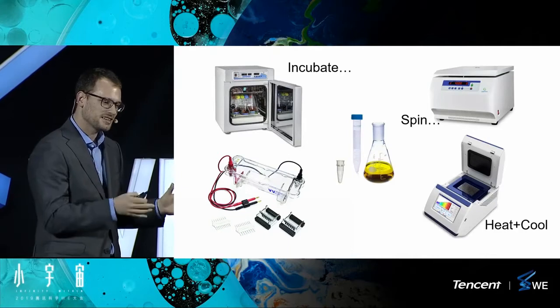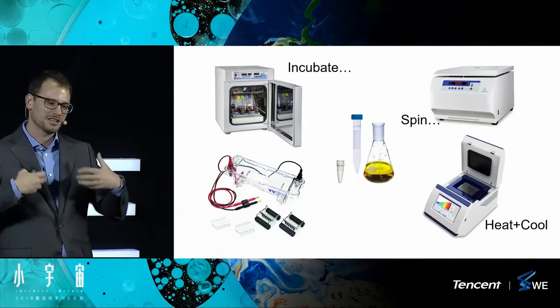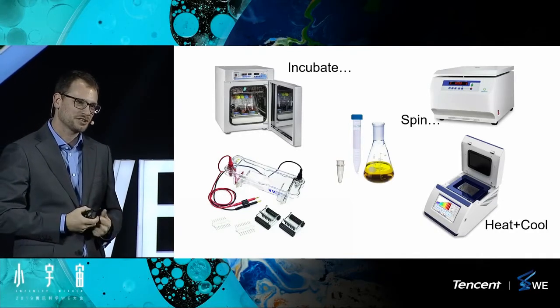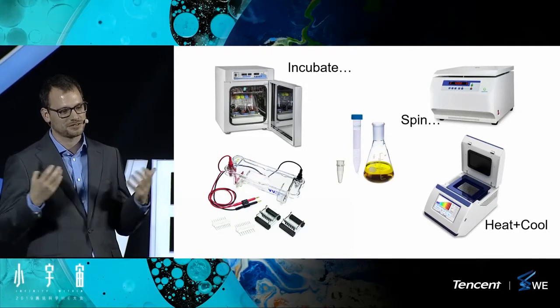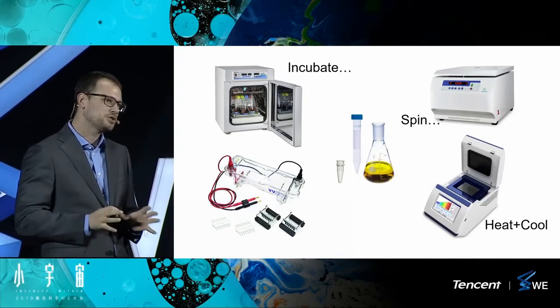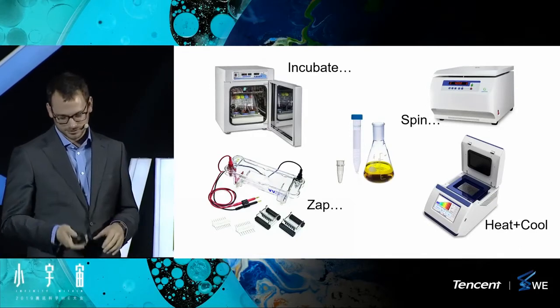The last thing here, that's an electrophoresis chamber. Again, this we use to separate samples, but now in a different context. And now we do it with electricity. You basically apply a current. You've got charged particles. Depending on the size and the charge of a particle, they will move at different speeds, and therefore you can separate them. So these kind of tools are absolutely everywhere when you go into a well-funded molecular biology lab.